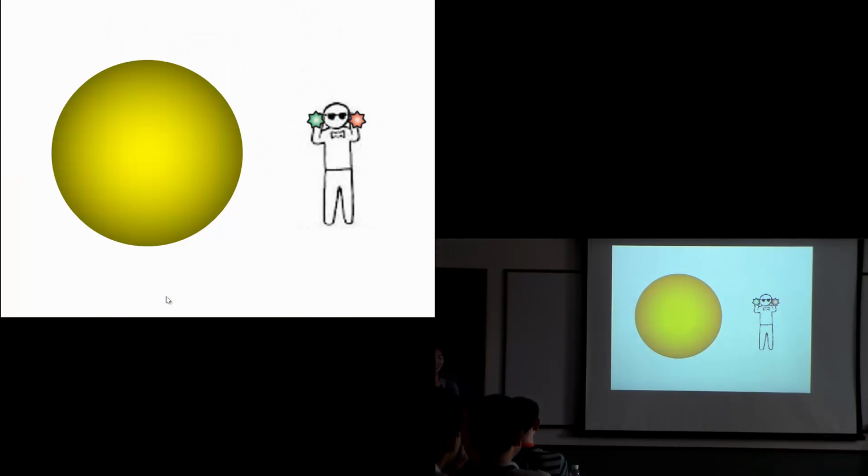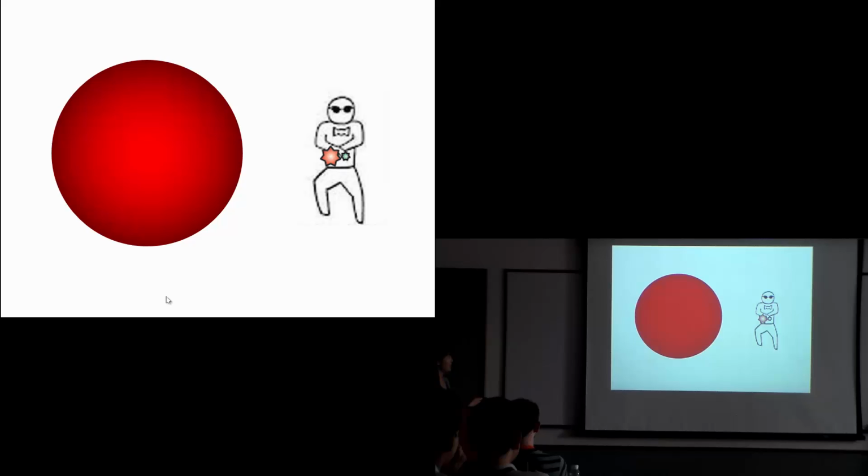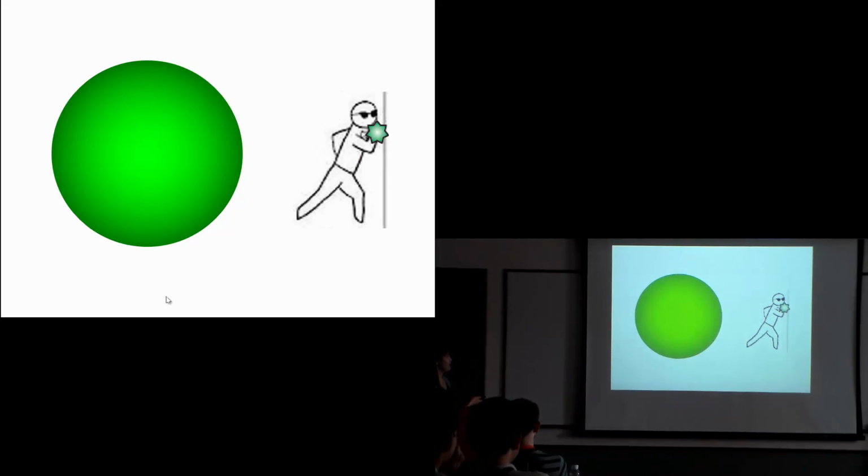So here's the FRET. When the FRET dye-to-dye distance is intermediate, you get a mid-FRET, followed by a low FRET when the dye distance is far apart, then a high FRET when they're both close together. Then red dyes typically photobleach early. So when the red dye photobleaches, the experiment ends. That's a photobleach state where you only have green dye.